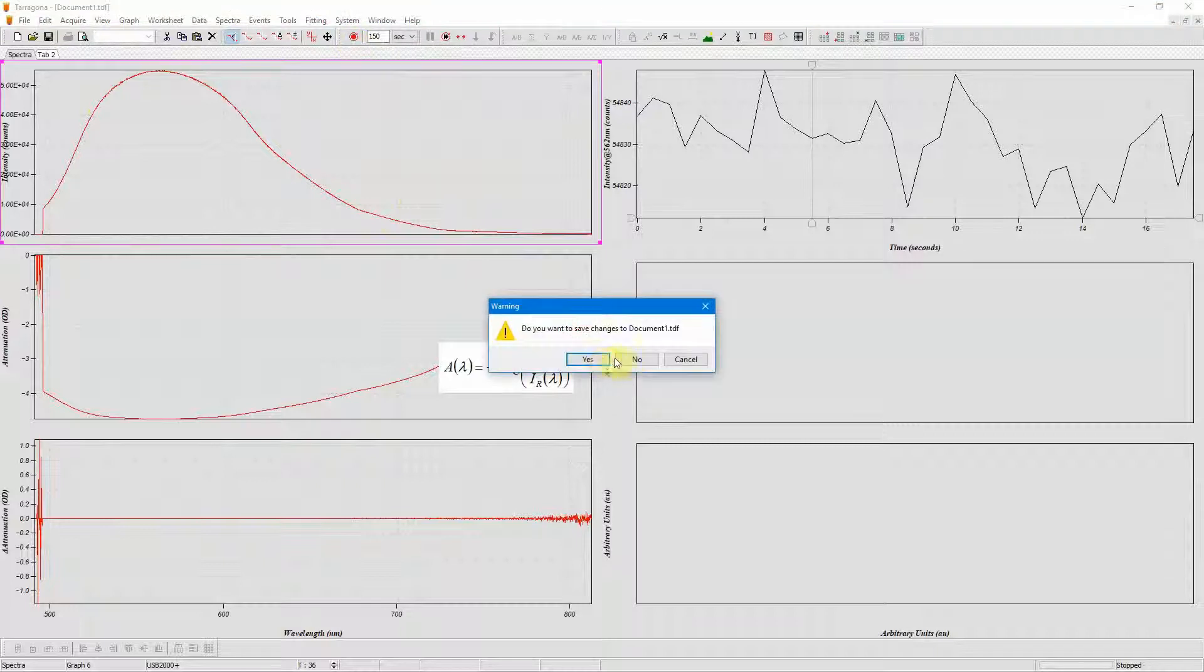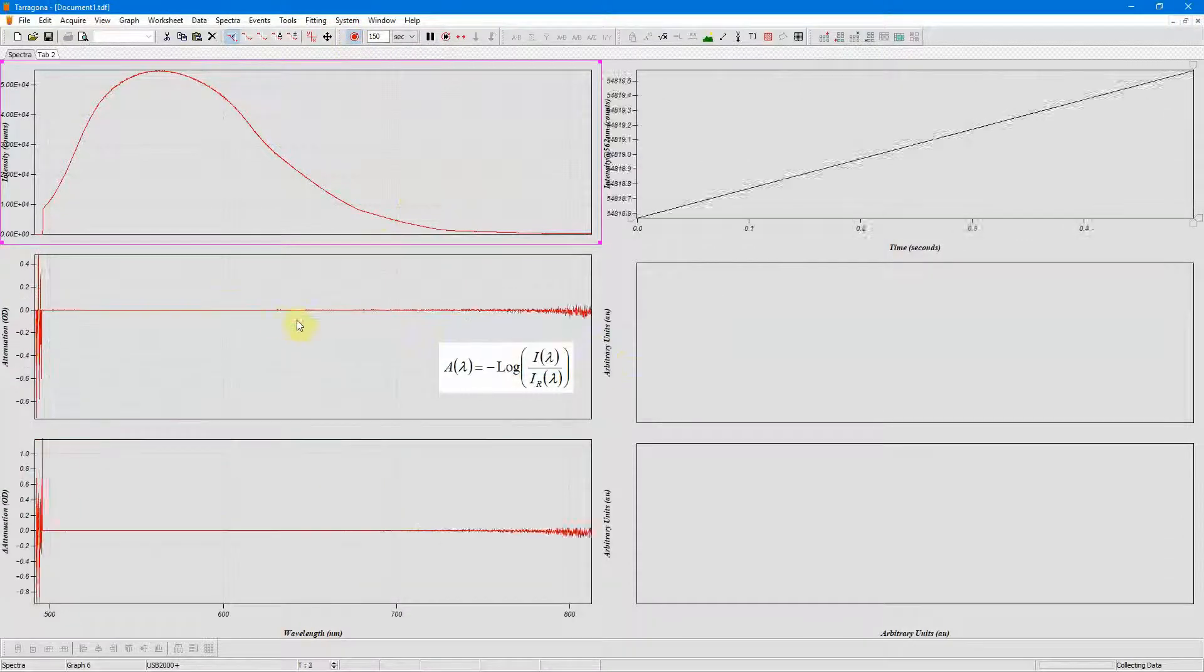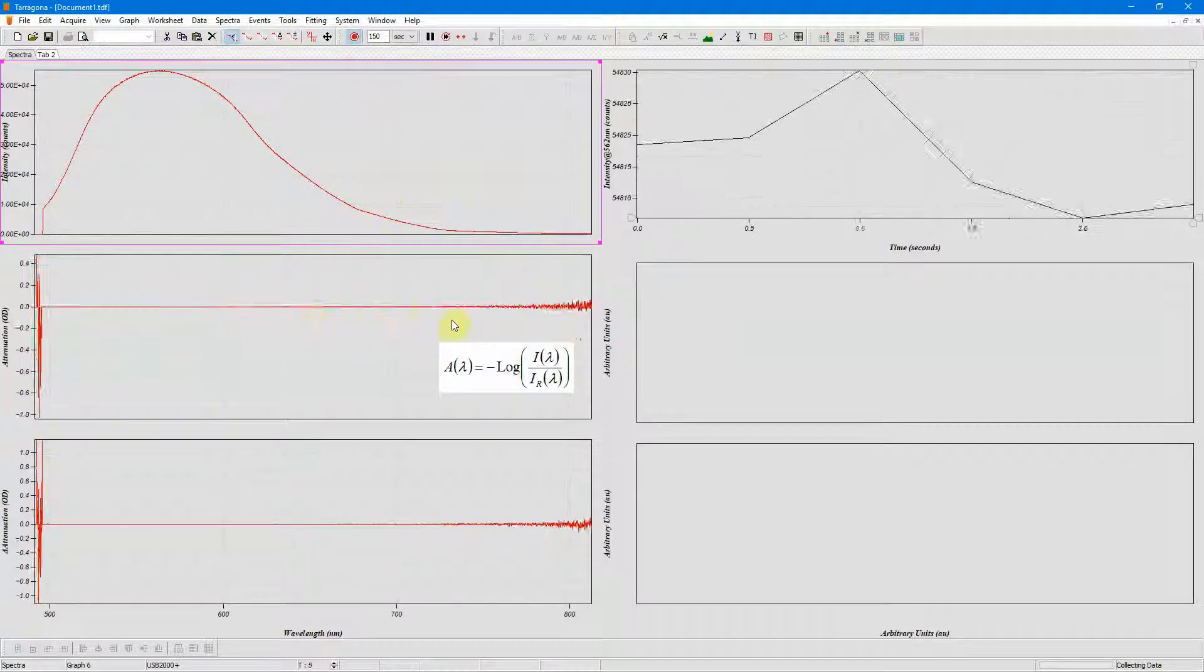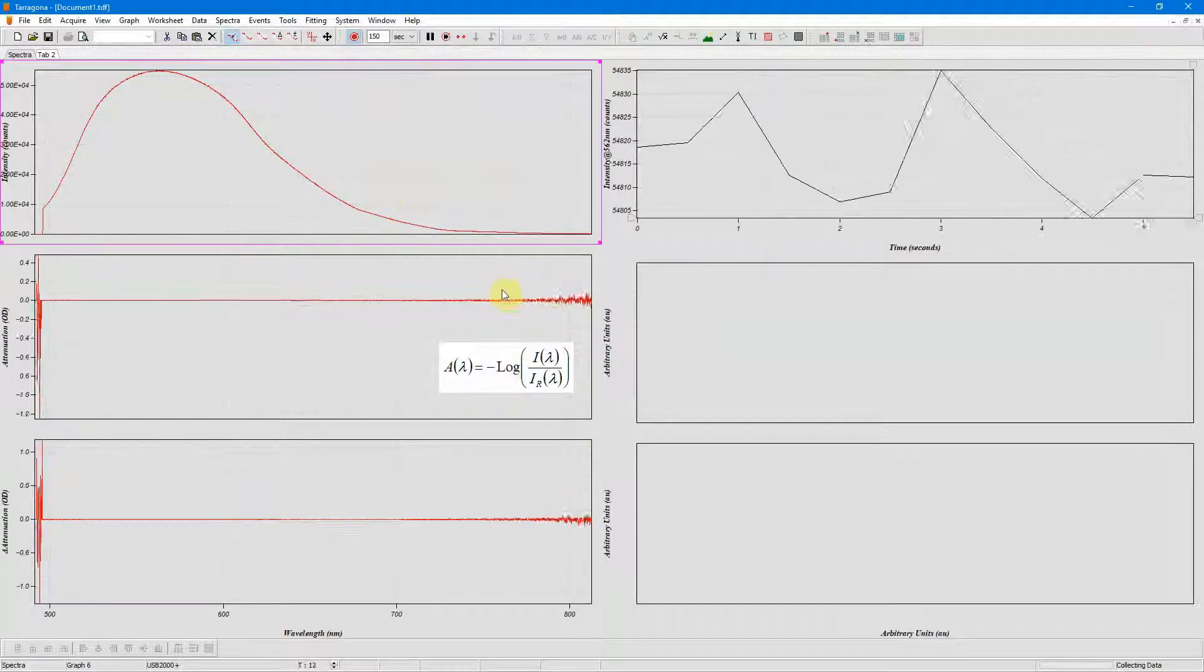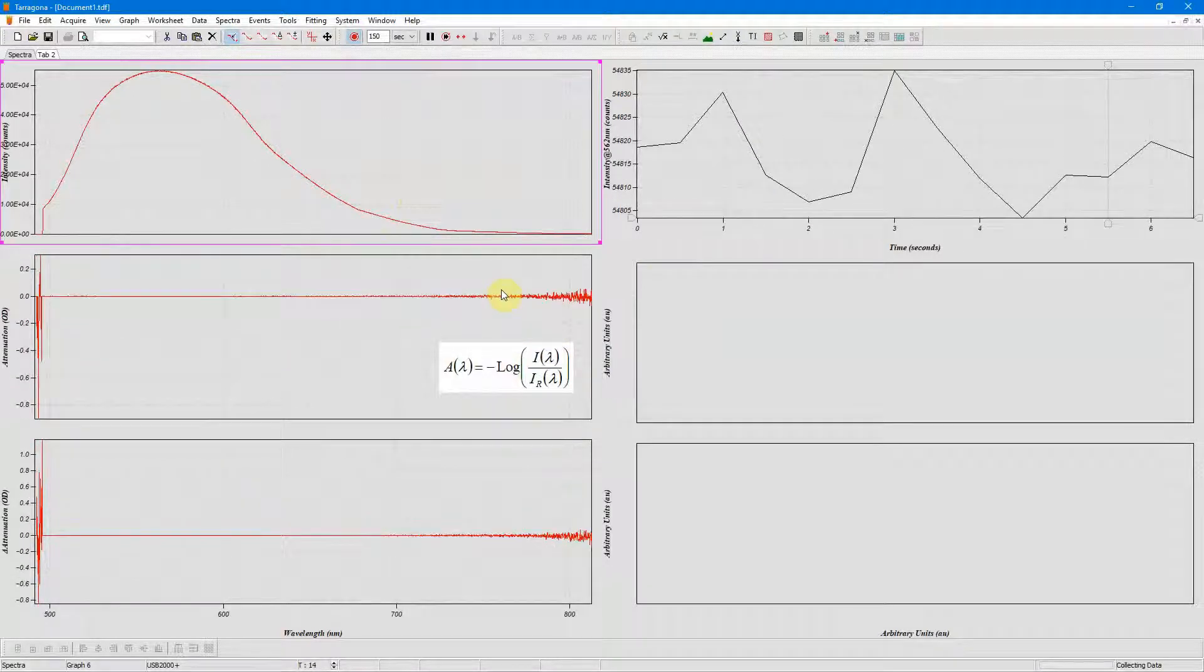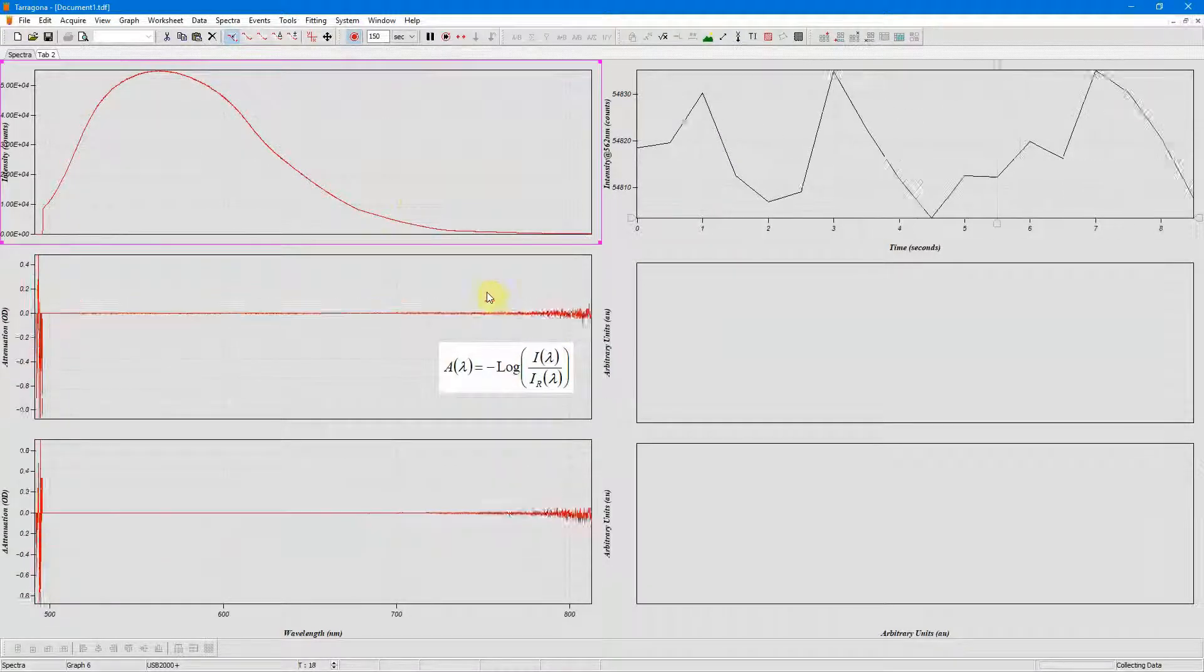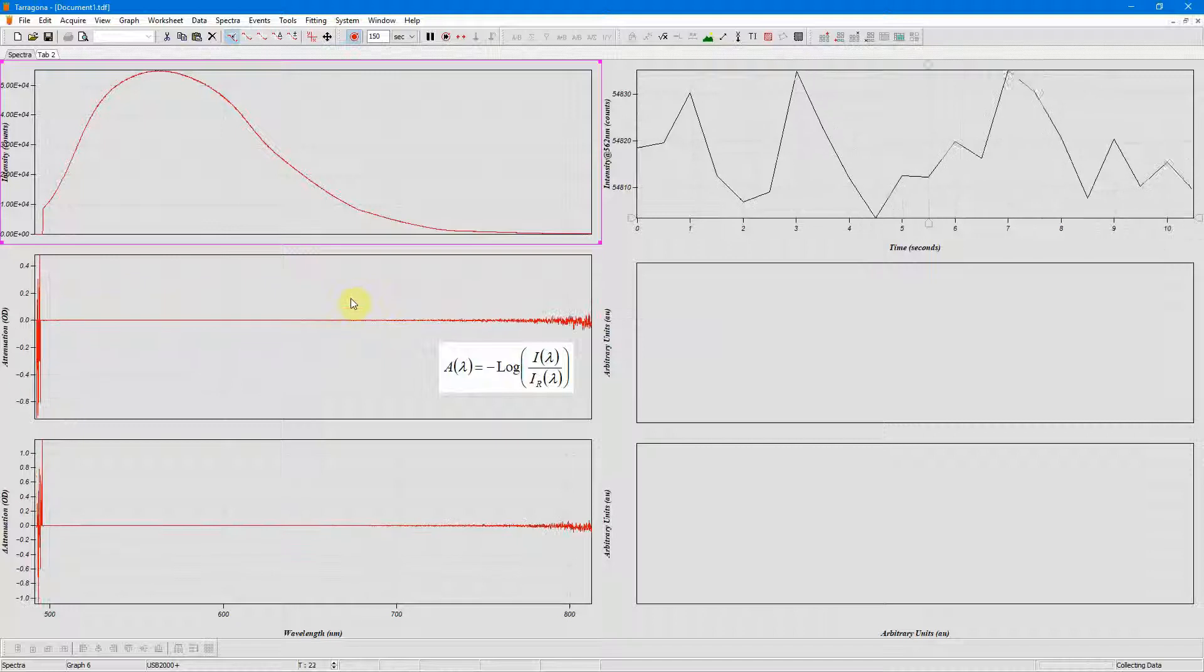Now when I start collecting data you can see that my attenuation spectrum is now flat and zero and I've done my intensity calibration. I can now add my sample to my cuvette and measure its attenuation spectrum.